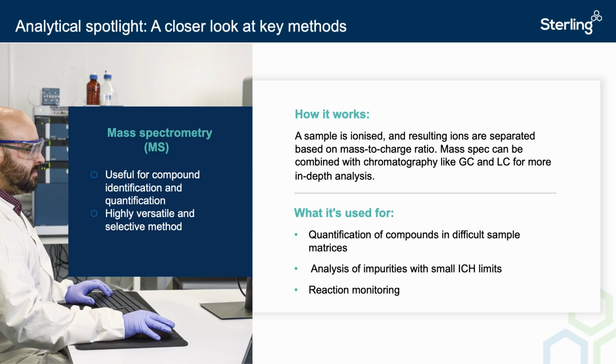Atmospheric pressure chemical ionization, or APCI, is a slightly harsher ionization method than ESI and may result in higher fragmentation of the analyte of interest. A solvent spray is heated to a high temperature and injected into a nitrogen stream. The entire resulting aerosol cloud is passed over a corona discharge needle that generates ions as the solvent evaporates.